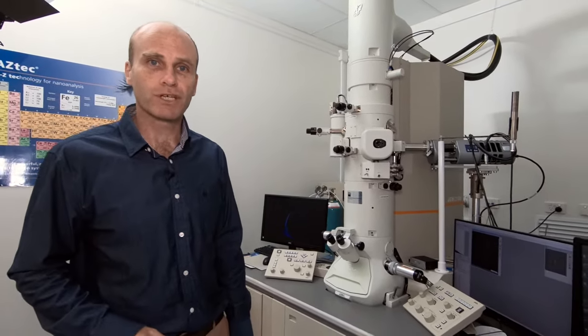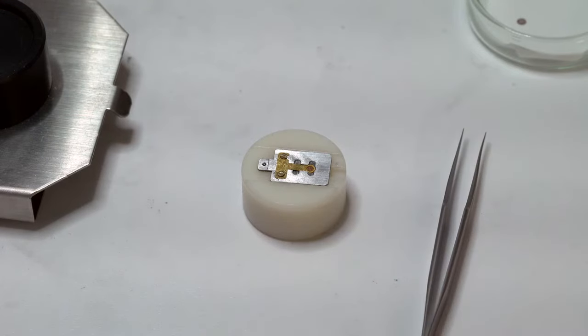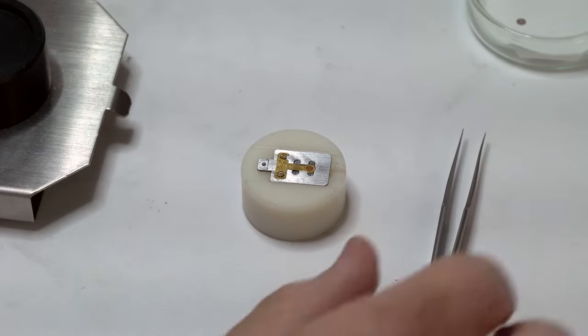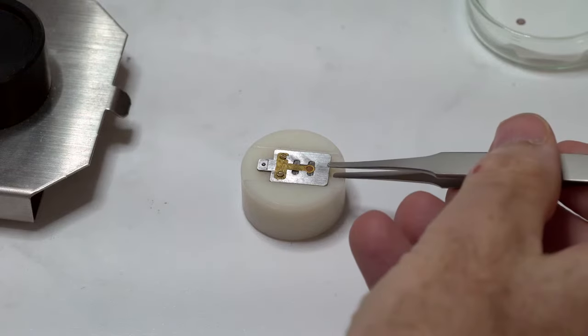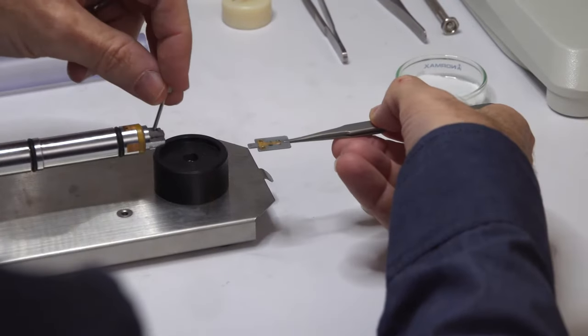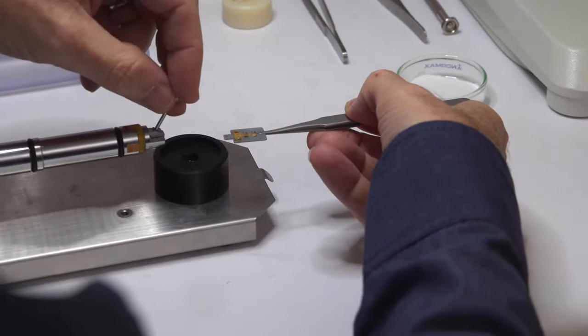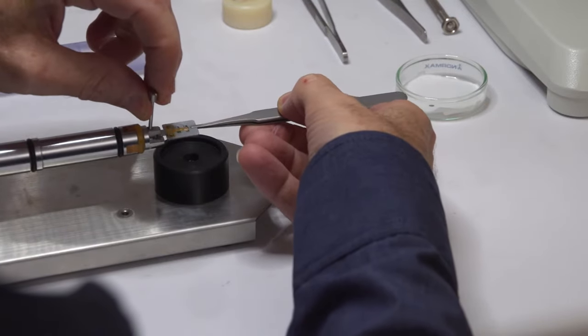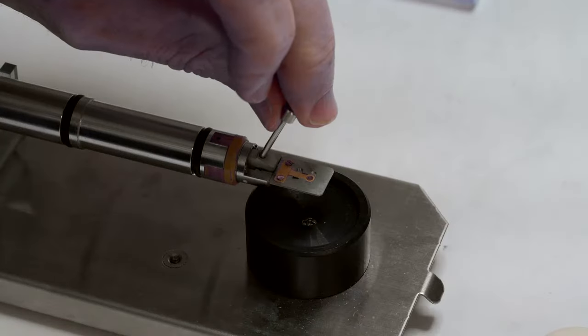But before we can do that, we're going to need to load our sample into the microscope. We've already applied it to the copper grid and we'll put the copper grid into the tip, the removable tip you can see here. And so now we'll load that onto our sample rod, thus. And now we can put that into the microscope.